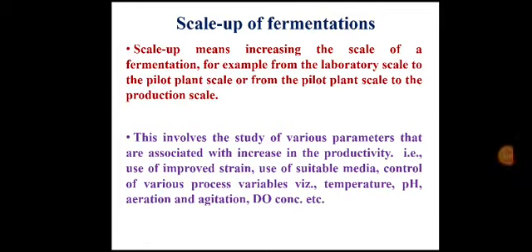Scale up of fermentations. Scale up means increasing the scale of a fermentation, for example, from laboratory scale to pilot plant scale, or from pilot plant scale to the production scale. This is the simplest meaning of scale up of fermentation: to increase the scale of fermentation, which is related to increasing the volume of fermentation broth from small scale to higher scale.